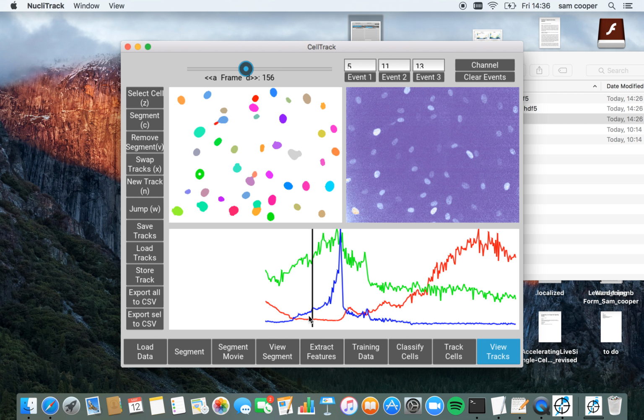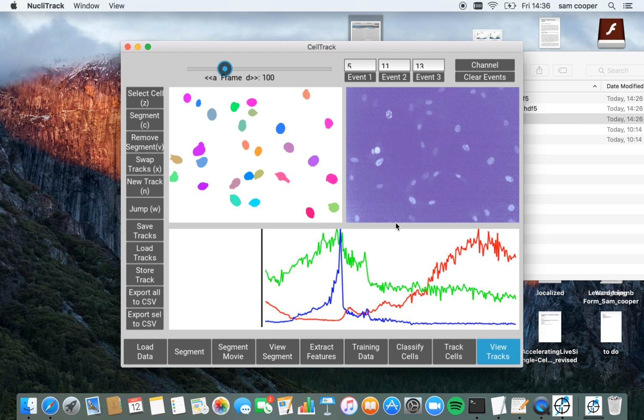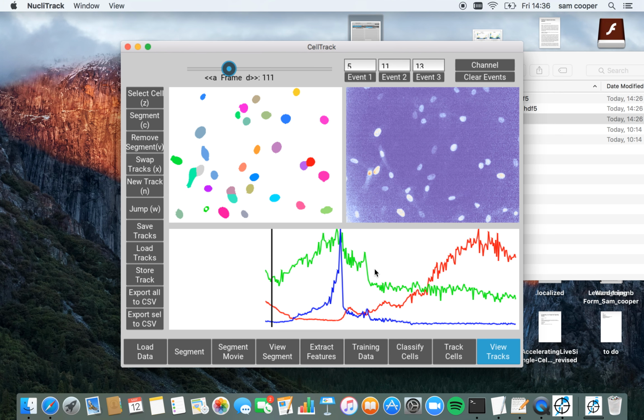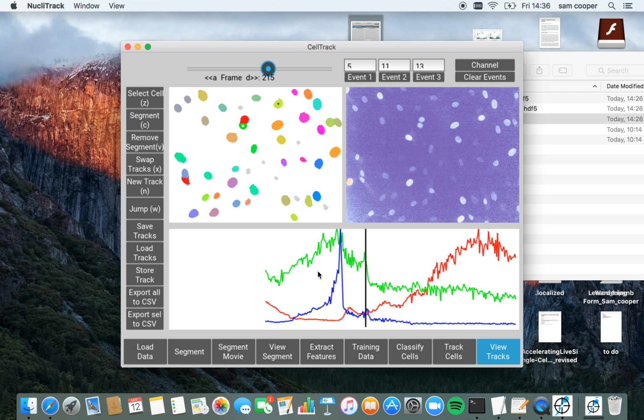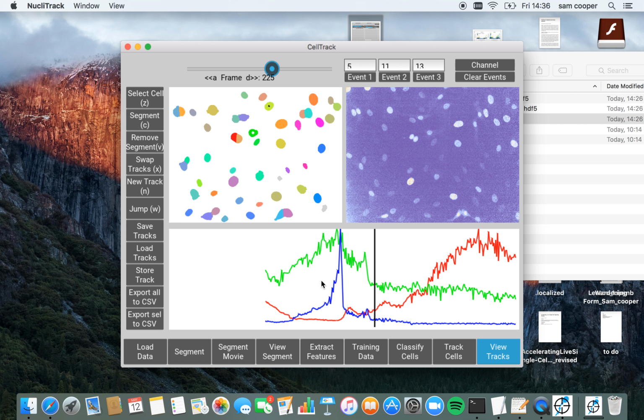Again, there we go, the cell's entering S phase quite nicely here. P21 levels drop off, PCNA foci are increasing. So let's see if we can track the nuclei for any amount of time previously. It looks like it comes onto the field of view about there. So this is a nice track here: it comes onto the field of view, we track it over S phase, then it's exiting mitosis here, and we see a mitotic event, and then it tracks effectively for the rest of the frame.